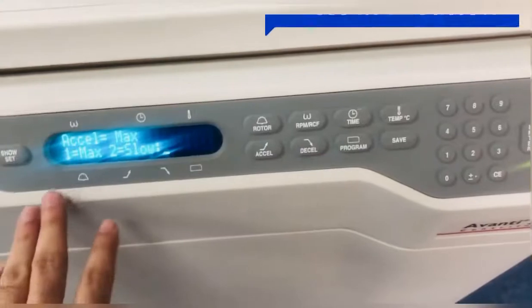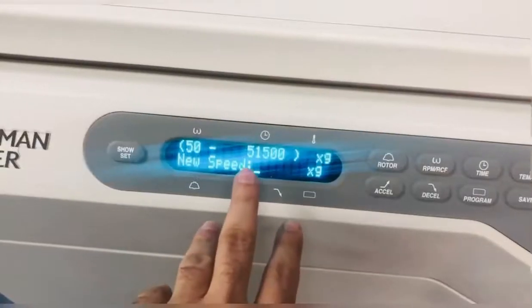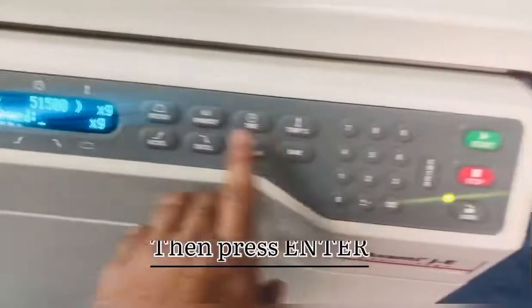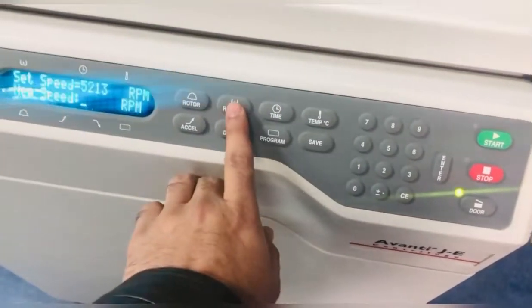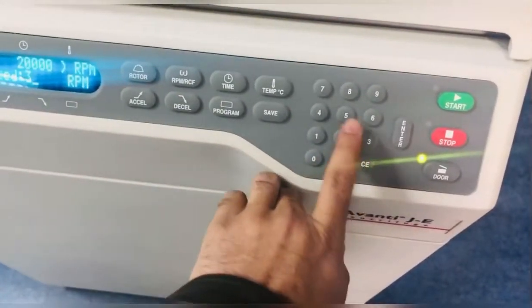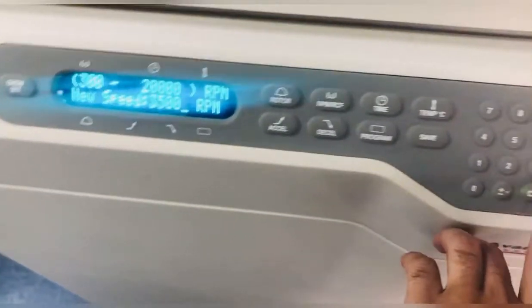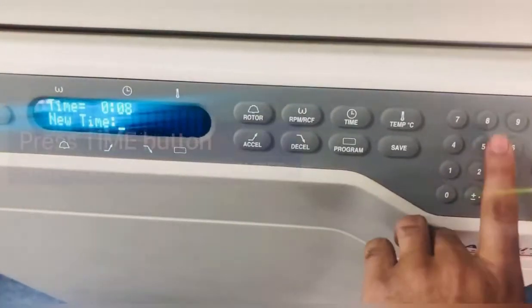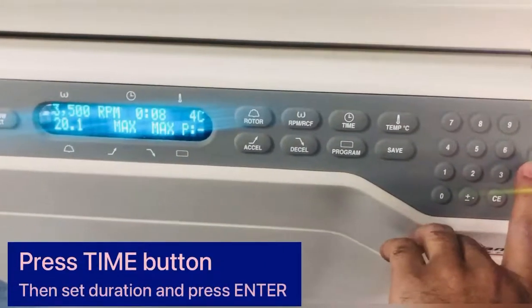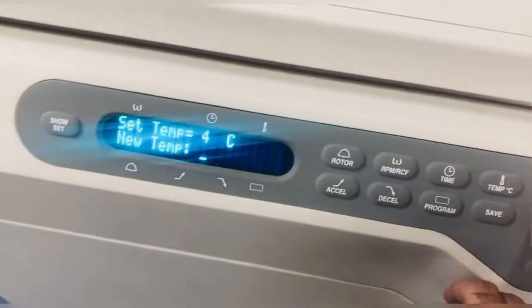First of all, if you have to set RPM, you should click here. I have set it to 3500. This is the touchpad — click on RPM and you can set it. Then set the time; I have chosen 8 minutes. Enter. Then temperature — I have already set it to 4. Enter.